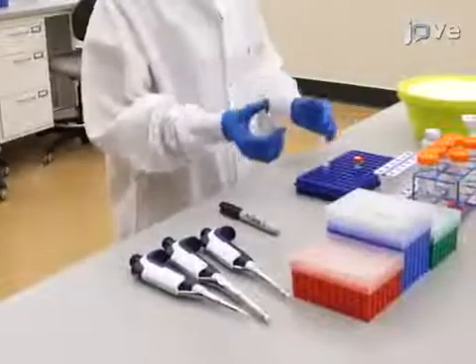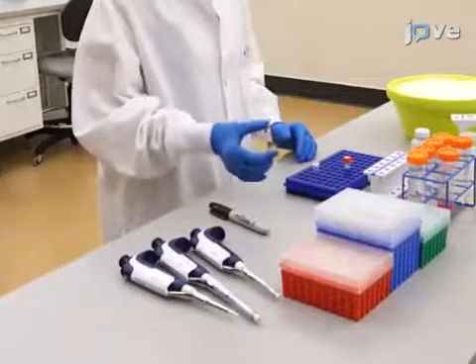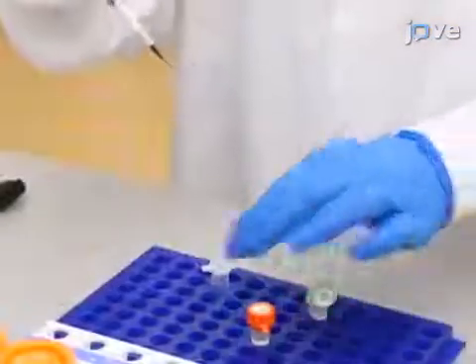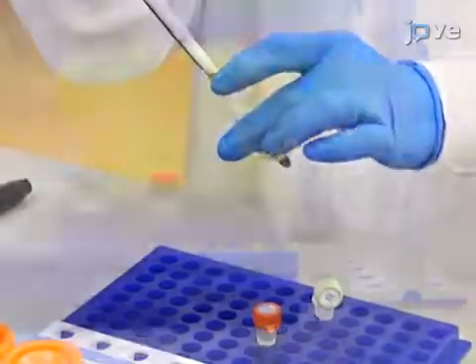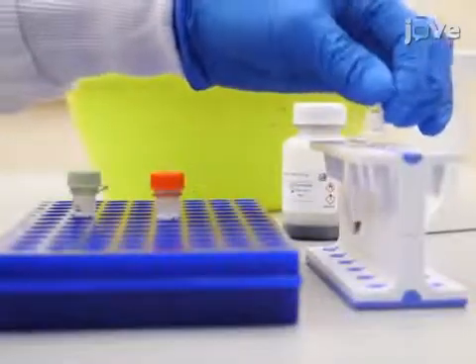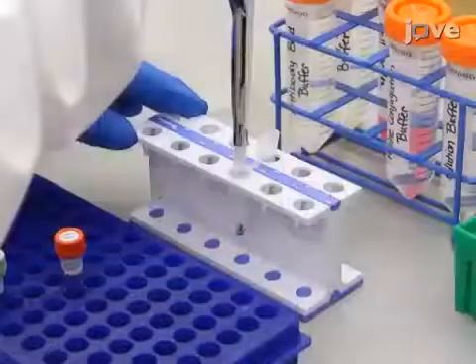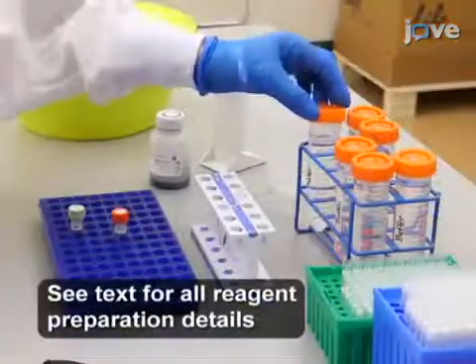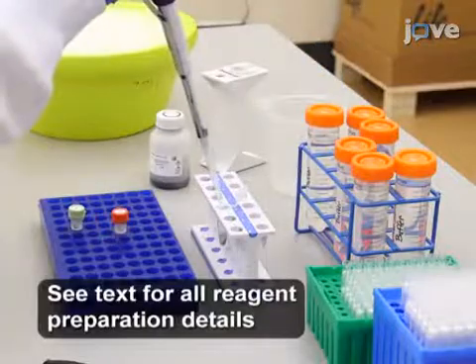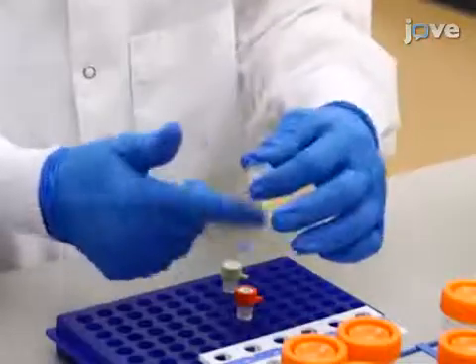Begin by uniformly re-suspending the beads with gentle shaking. Then add 50 microliters of beads to a 1.5 milliliter microcentrifuge tube and place the tube in a magnetic stand. After 10 seconds, carefully replace the storage buffer with 250 microliters of antibody binding buffer and mix the beads well.